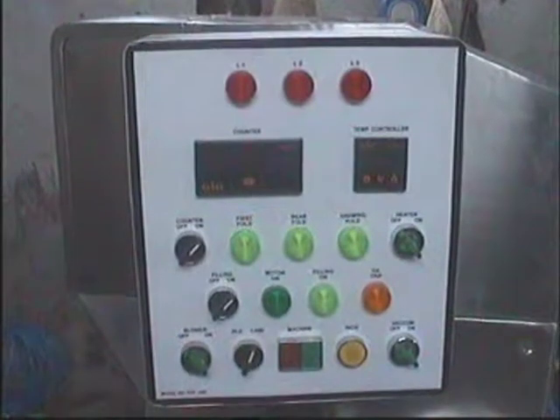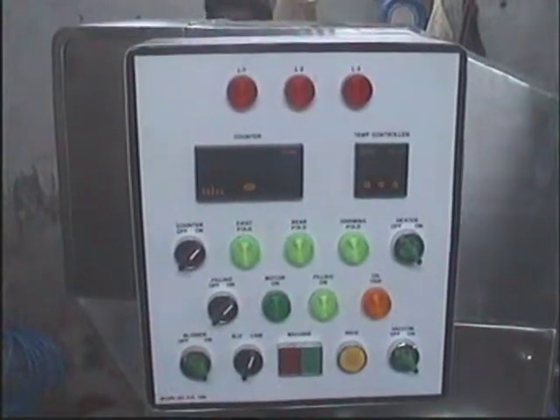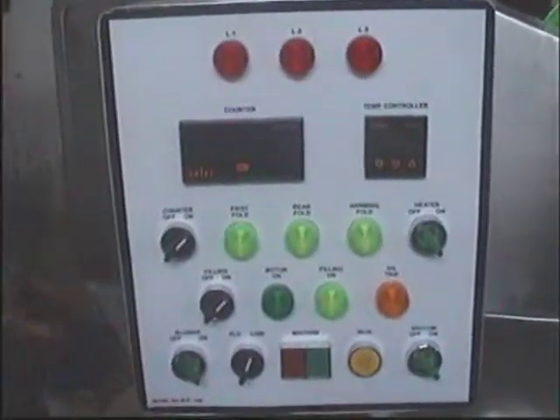This machine can fill both lamy as well as aluminum tubes. This is the control panel of the machine.